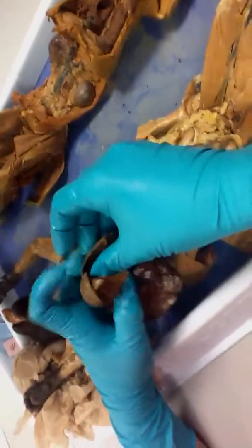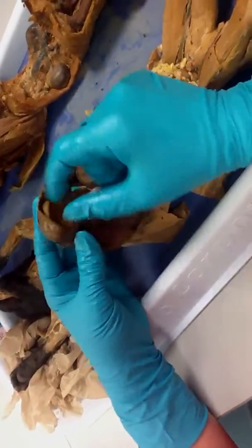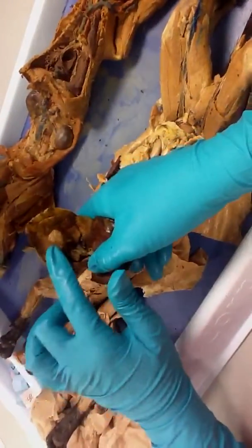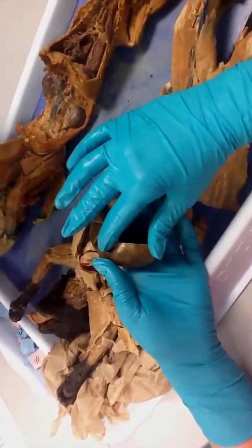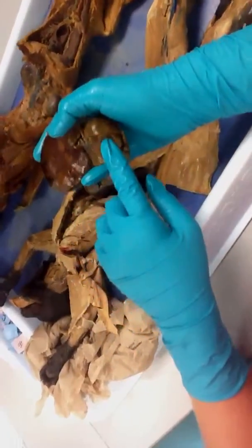And then we turn it over, and we've got two lobes back here. We have the right medial and then the caudate lobe. The right lateral. Sorry, this is right medial, this big lobe right here. The right medial is very large. Right lateral, caudate. So, left lateral, left medial, quadrate, right medial, right lateral, caudate.